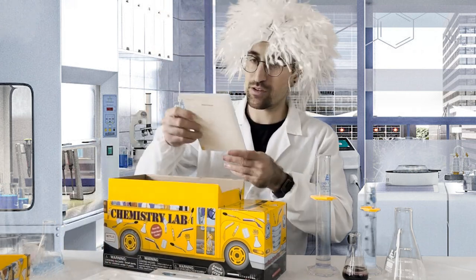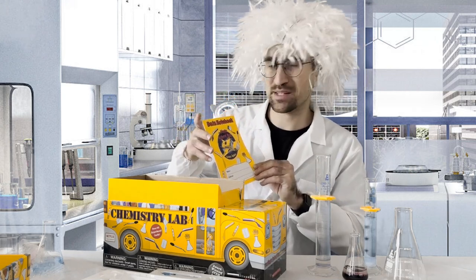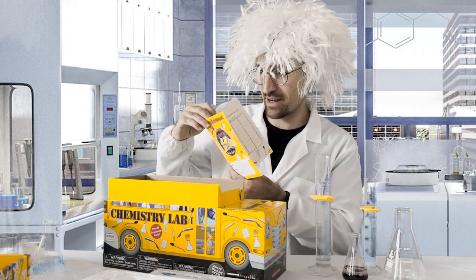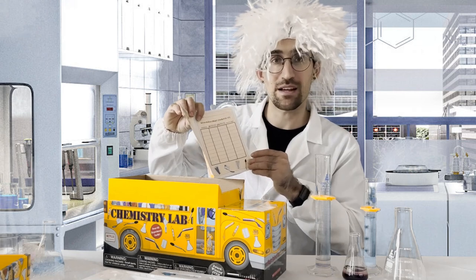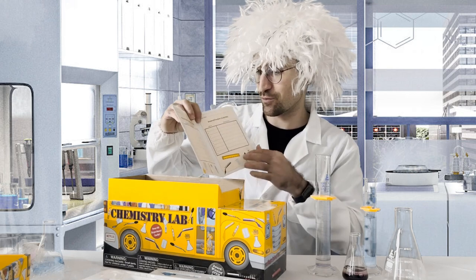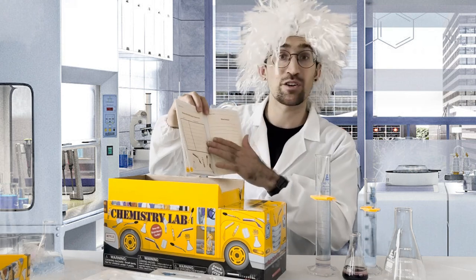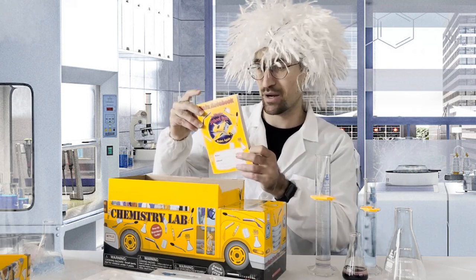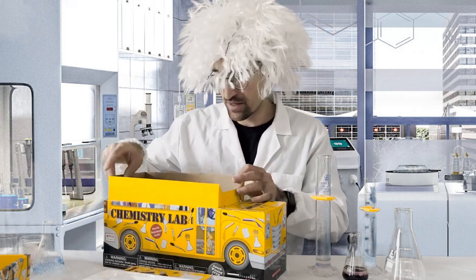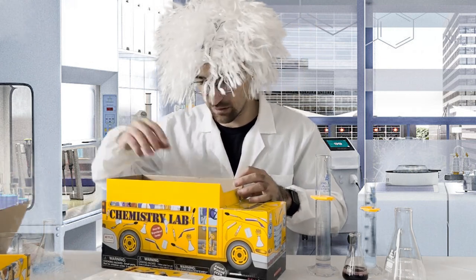Next we have a data notebook. This is a great way, as you go and do experiments, to write down and identify what happened, what data you collected, and what some of the results were. There are different cards in here, and a lot of students have fun doing this at home — you can put in your observations and have a logbook of exactly what happened.